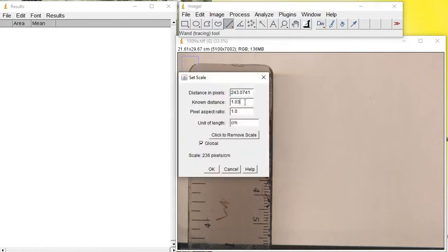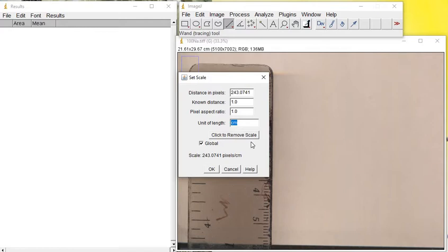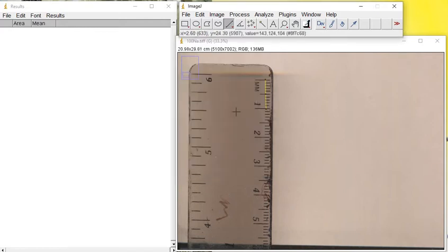I will put 1.0 centimeter and make it global if you are measuring several images with the same scale. Then when you click OK, it sets up the scale.